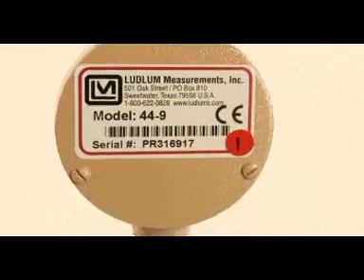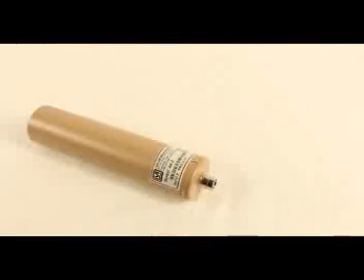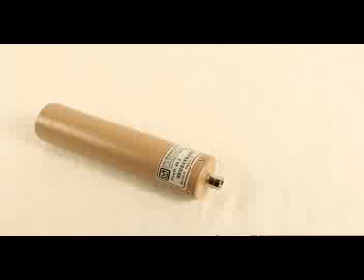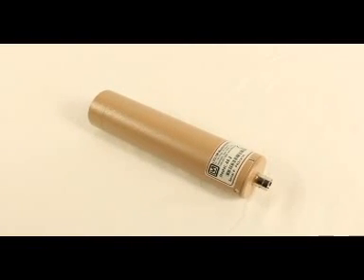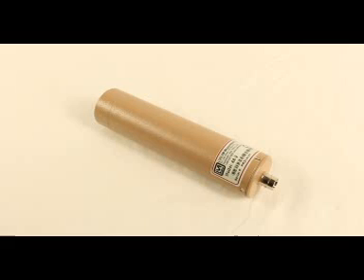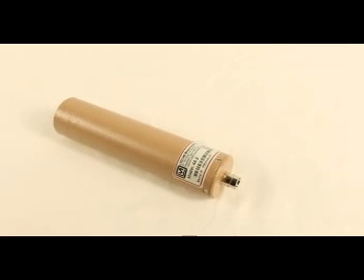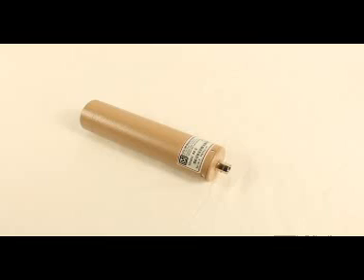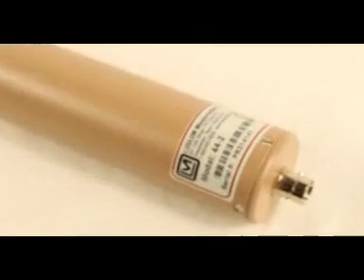The reading when using this probe will be displayed in counts per minute or kilocounts per minute. The Model 44-2 or gamma scintillator probe is best used for radiation area surveys. It will detect gamma only. When using this scintillator probe, readings will be displayed in micro-R, milli-R, or R per hour. When reporting these readings, make sure to include the correct units.